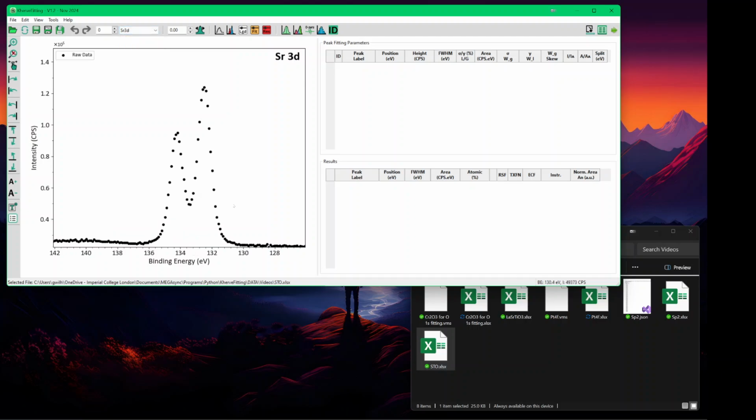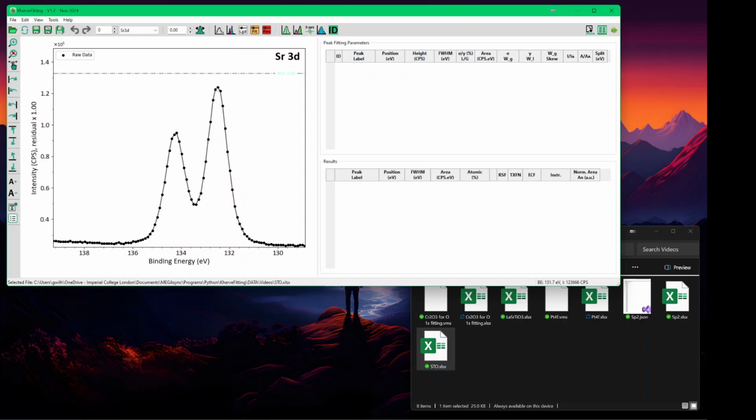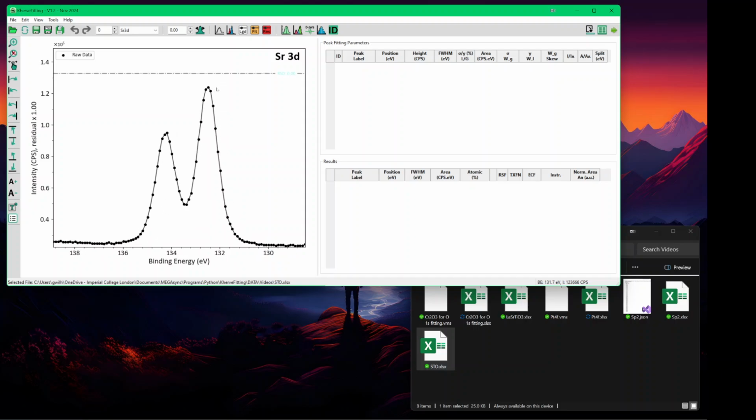We can zoom in and out to get to the plot, and that can be done by keyboard or by zooming. So Control plus is one we can use, and maybe Control left or right to just move the plots.